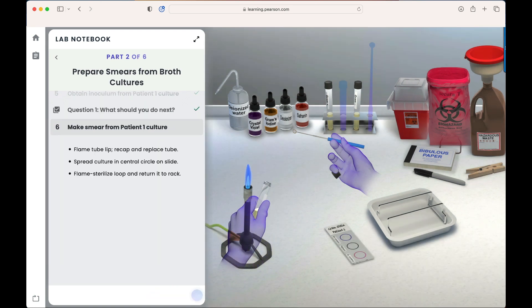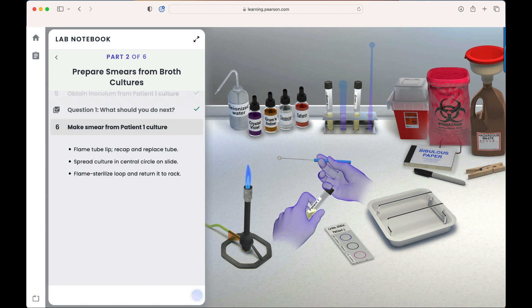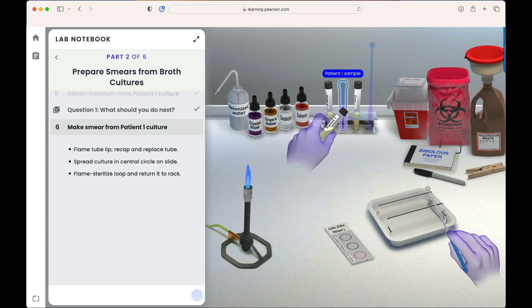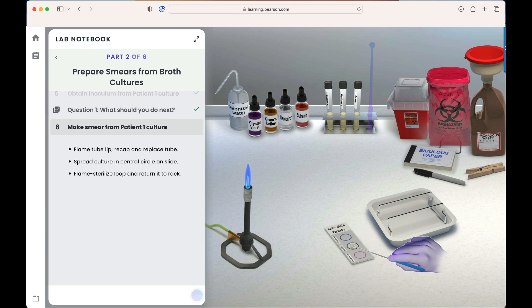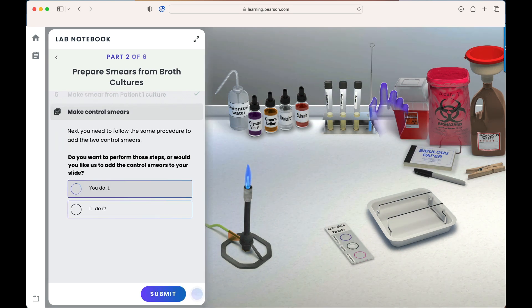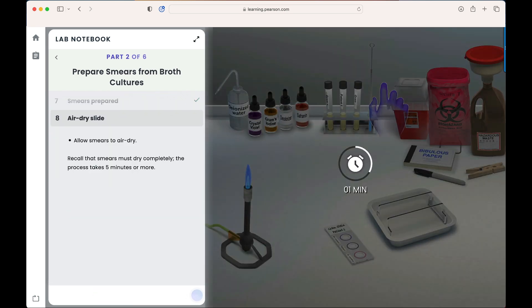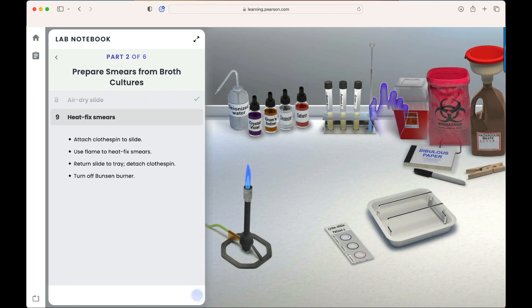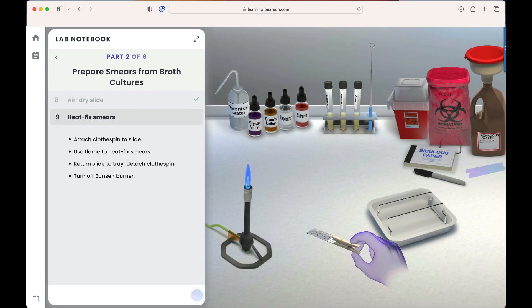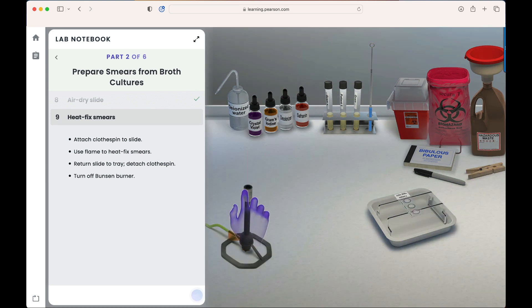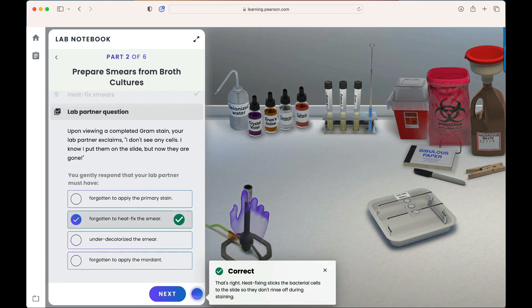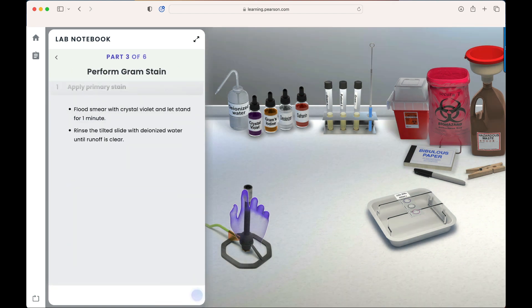We're now asked to make the smear from patient one's culture. We add culture to the slide, allow it to air dry, then heat fix the smears. We would next continue through the steps to perform the gram stain, but in the interest of time, we'll skip that here.